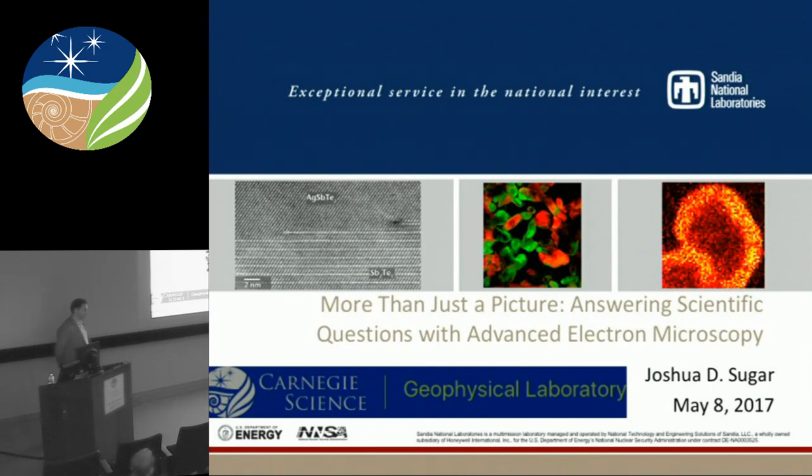And the thing is, for me, when I'm interacting with my colleagues, often they'll say, you know, thank you so much for that picture. And what I've tried to do in my career so far is really go beyond just the picture and show that we can do more with electron microscopy than just take a picture. And we can really be quantitative and get at the fundamentals of transport and materials using microscopy. And so that's what I want to talk to you about today.